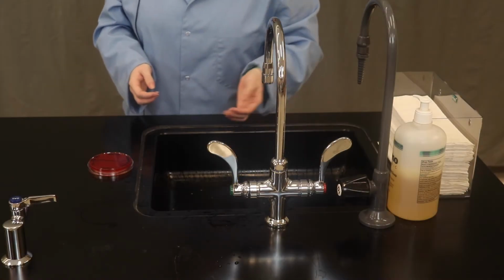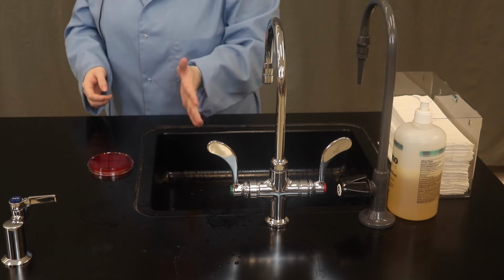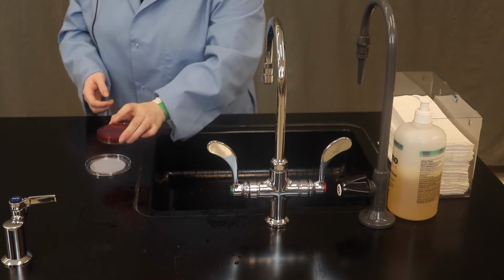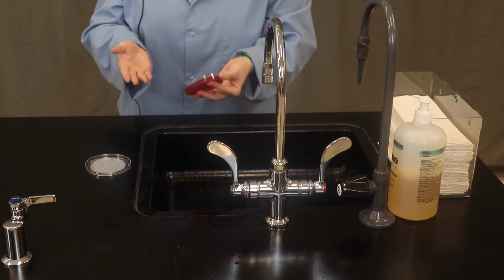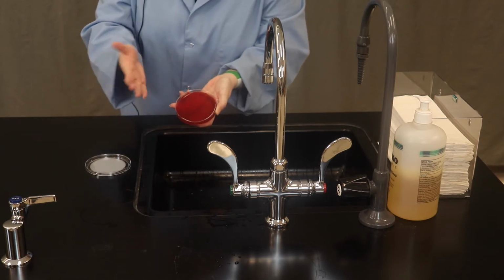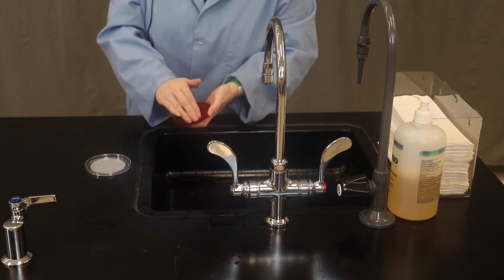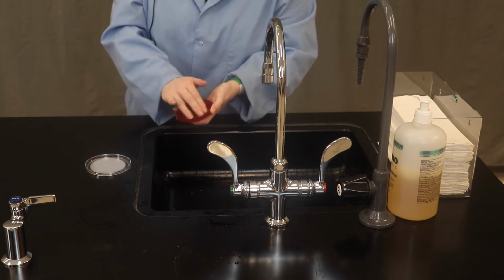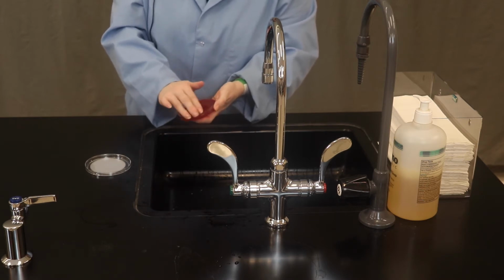Before we wash our hands, it depends on how many supplies you have in your classroom. You may be given, just so you know, one whole plate that's before and one whole plate that's after. I'm just cutting down on supplies here and using one. But before I wash, I want to touch the Petri plate and just see what's growing on my skin. I'm going to try and stay where that black line is. I don't know if you can see it from this angle, but remember I divided it. I'm going to rub my fingers all over the before side. That should be plenty.